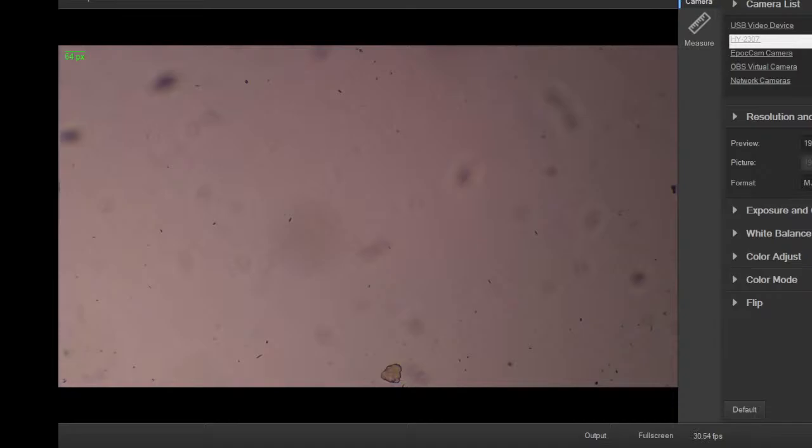Second thought to this one. This guy's definitely moving more like a tick than a mite. This might actually be a tick instead of a mite. These other ones were mites, because this one definitely looks less hairy. It does look different than the other ones did.